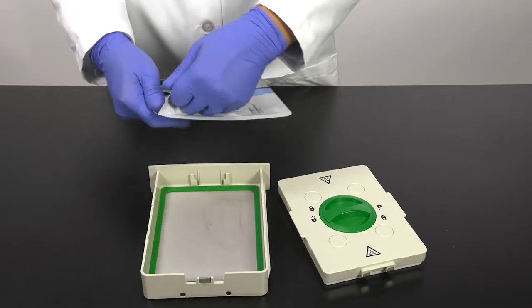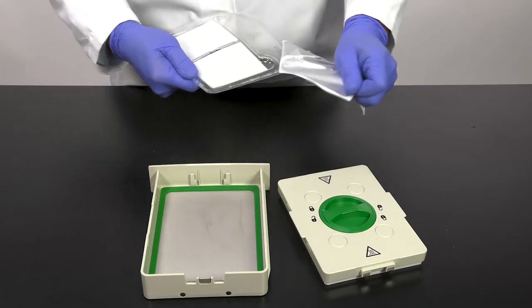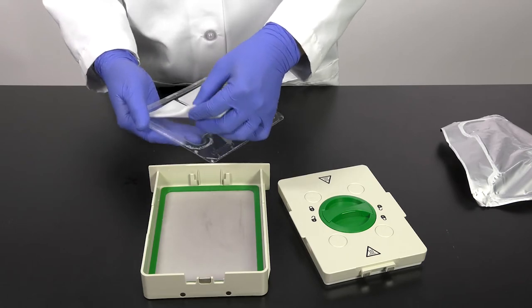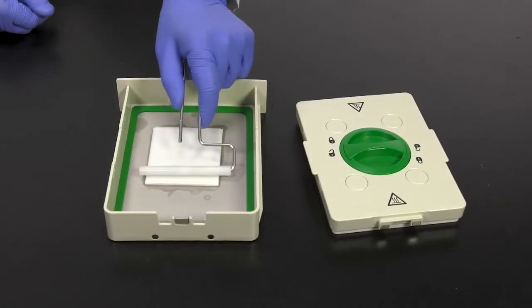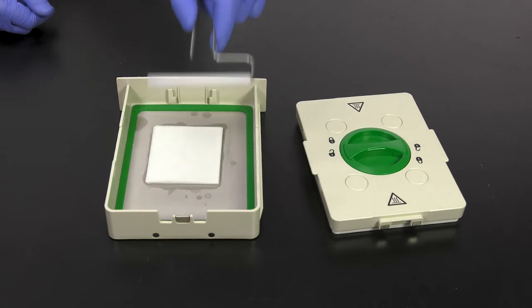First, open the transfer pack by peeling back the foil to reveal pre-soaked transfer stacks. Take the bottom stack containing the membrane and place it inside the transfer cassette with the membrane on top. Wet a blot roller with buffer, then roll the stack to remove any trapped air bubbles.